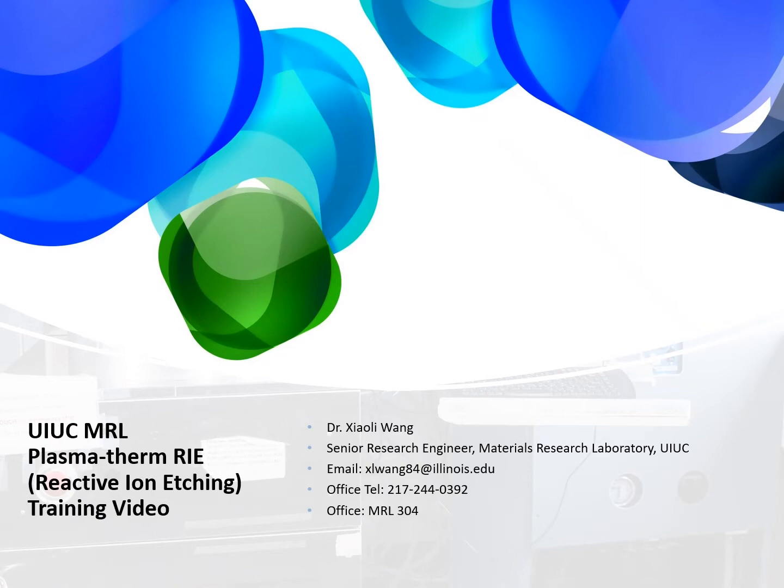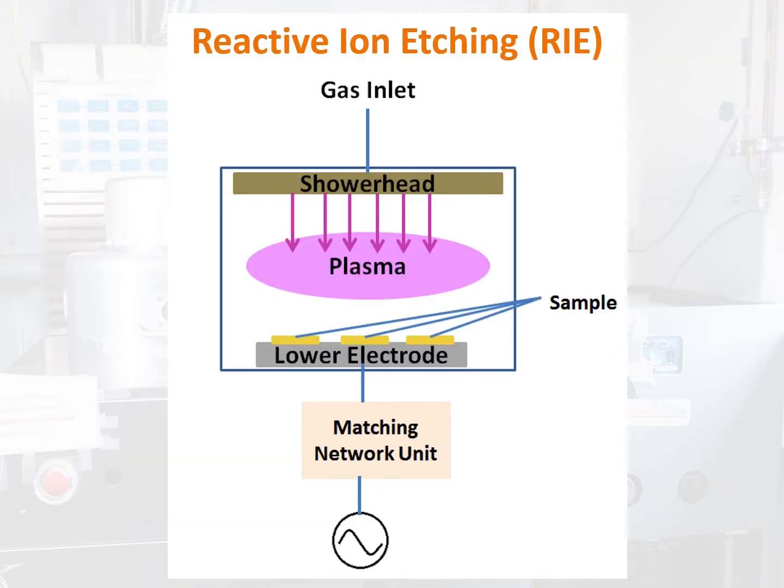Plasma-therm RIE training video. Introduction to Reactive Ion Etching.